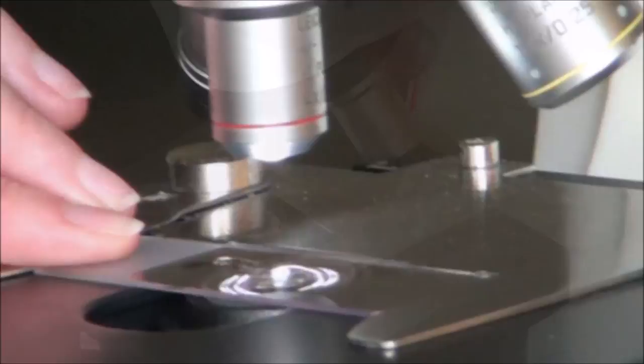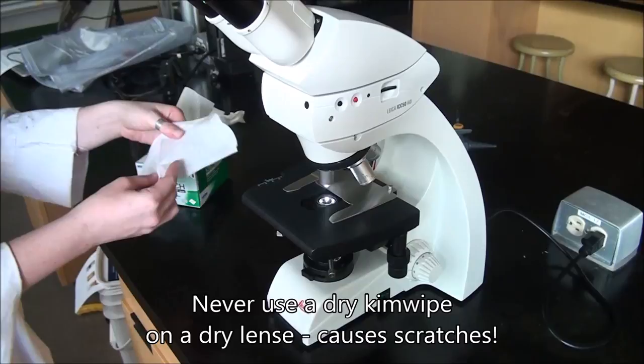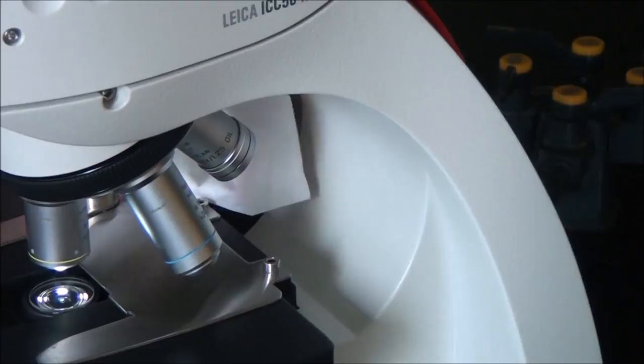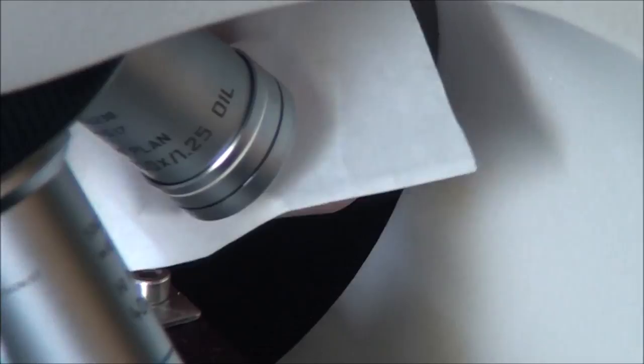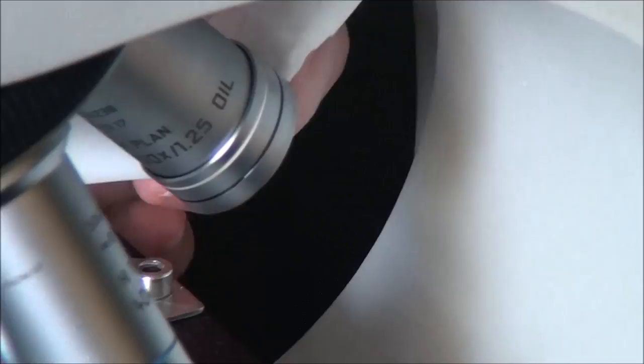Once the slide is put away, we do need to clean off the oil immersion lens using Kim wipes, which is an optics-grade paper. We're just going to move this out of the way a little bit more, and then we're going to use a circular motion to wipe the oil off the oil immersion lens. We do that three times just to make sure we get all the oil off, just a gentle slight circular motion.